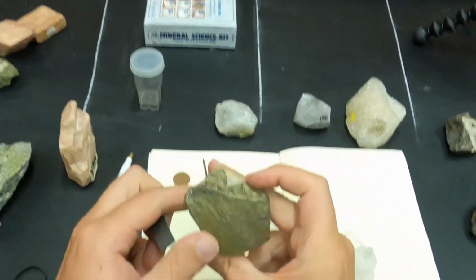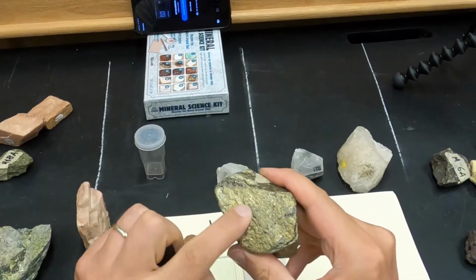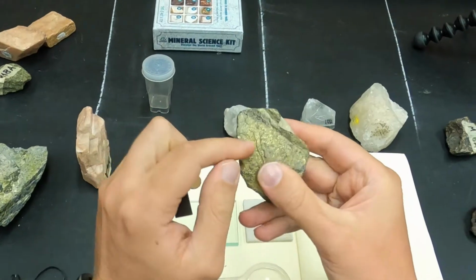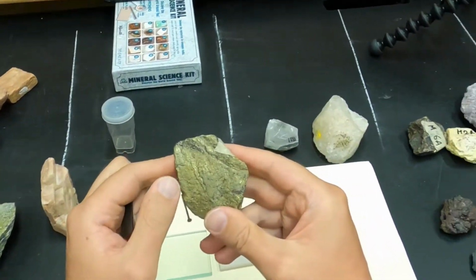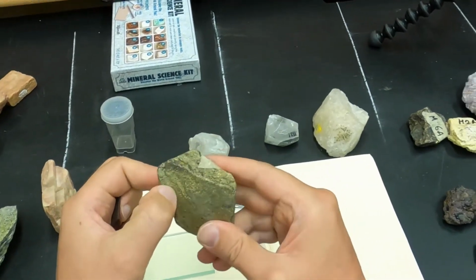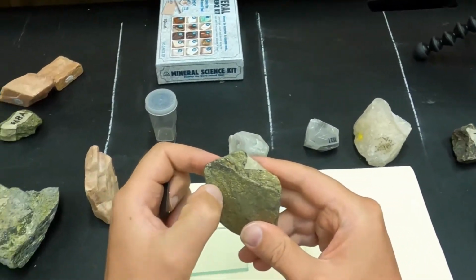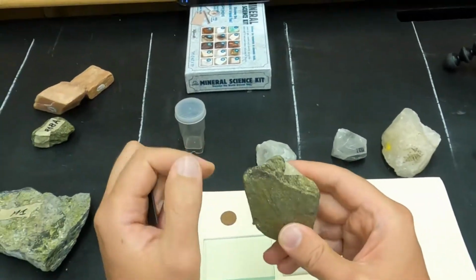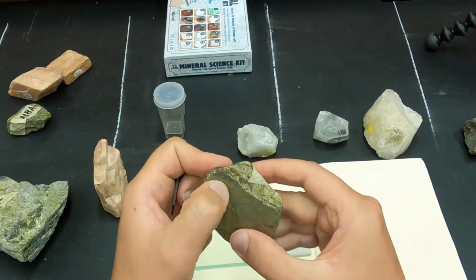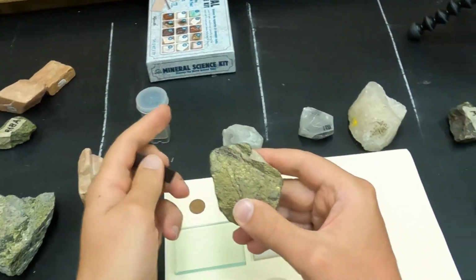In this case, if you look carefully, you can see this goldish mineral, which is your pyrite, or in some cases it's more orange like, so darker gold, and that will be your chalcopyrite, so a copper iron sulfide. And then we have other sulfides that are more bronze in color, and these are your pyrrhotite.